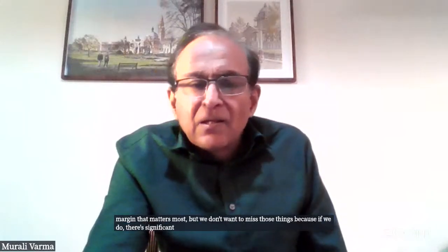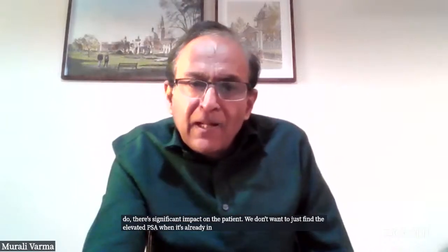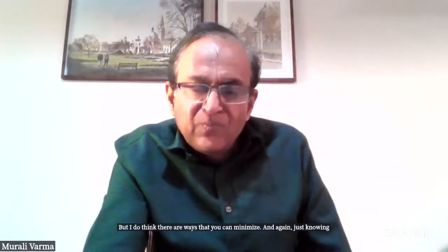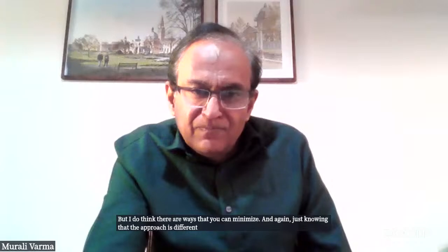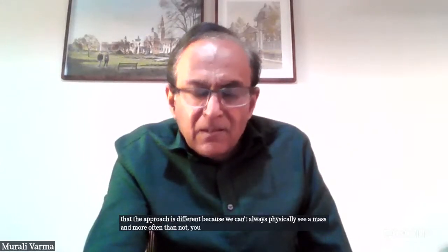But we don't want to miss those things, because if we do, there's significant impact on the patient. We don't want to just find the elevated PSA when it's already in their bones. So I do think there are ways that you can minimize, and again, just knowing that the approach is different, because we can't always physically see a mass, and more often than not, you're just seeing BPH nodules.